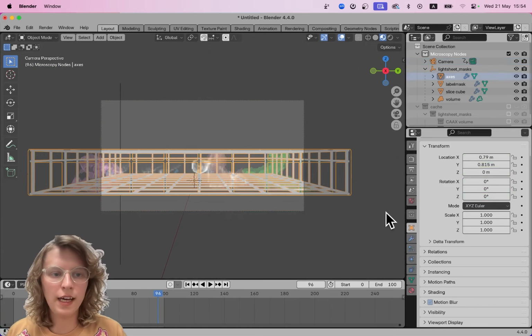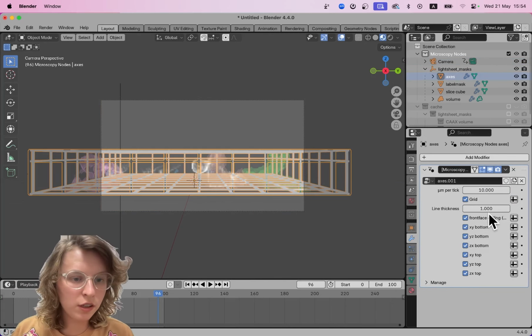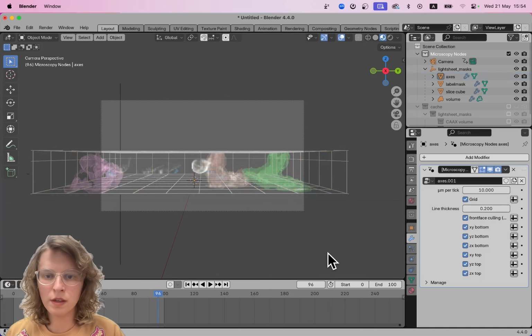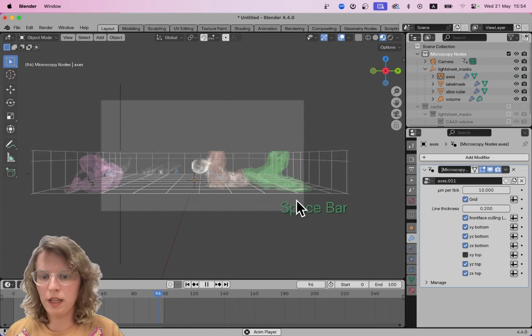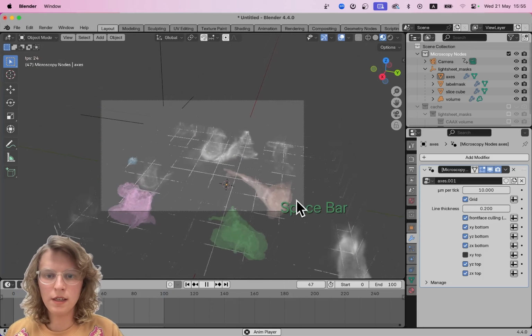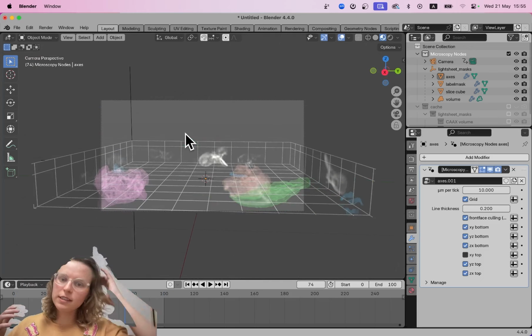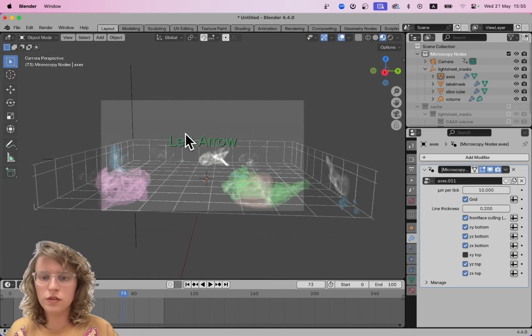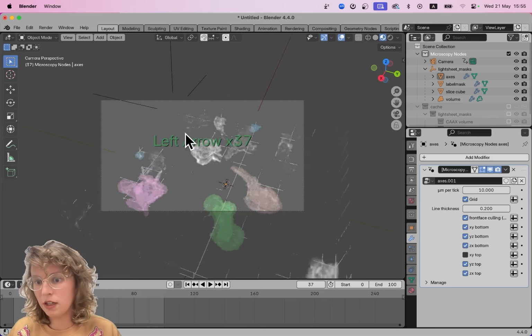So one thing is that the axes are very big, so I will just, here in the axis modifiers, make them a little bit thinner, and also remove the top. So that will be a little bit more smooth. And then also what's the issue is that our data moves slightly faster than we actually want to, because for each frame of camera movement, we also have one frame of data movement. So this is not amazing.